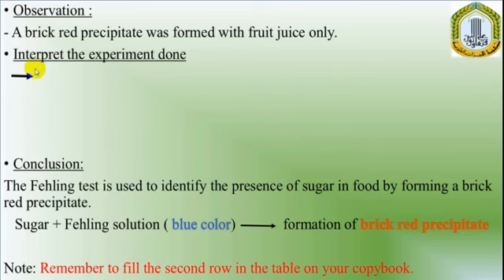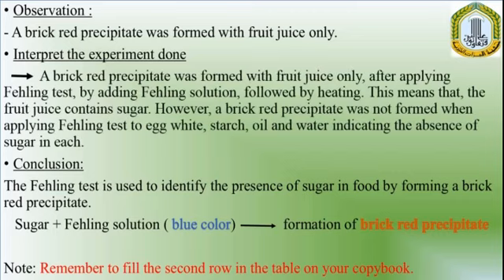Please take a few minutes and try to interpret the experiment done before presenting the answer. Remember that in order to interpret, you have to analyze the experiment and give a significance concerning the results. Did you finish? Well, here is the experiment's interpretation.